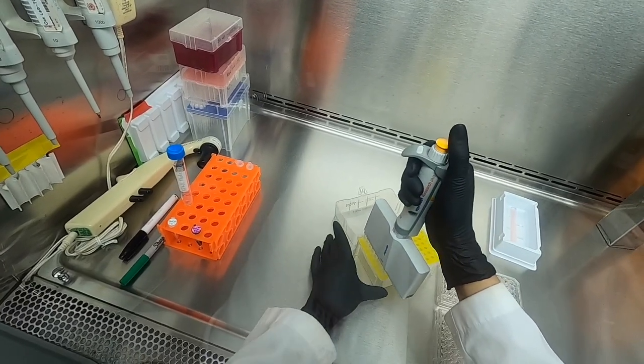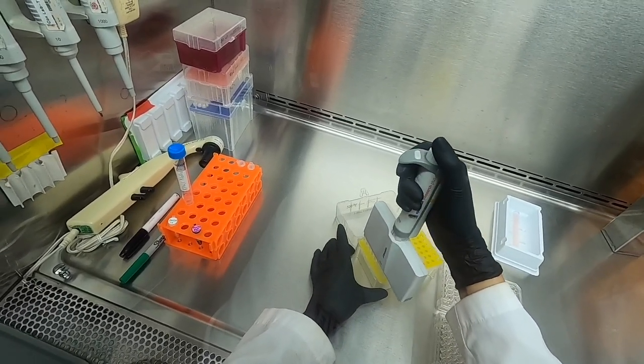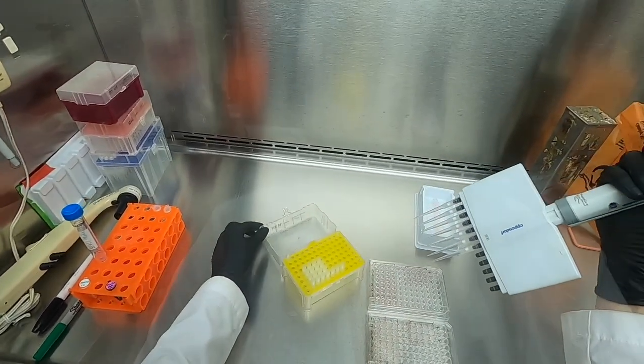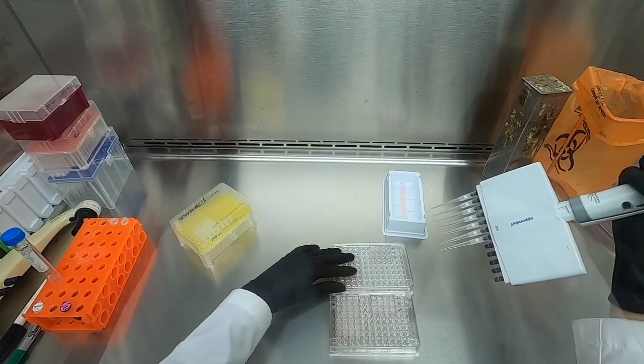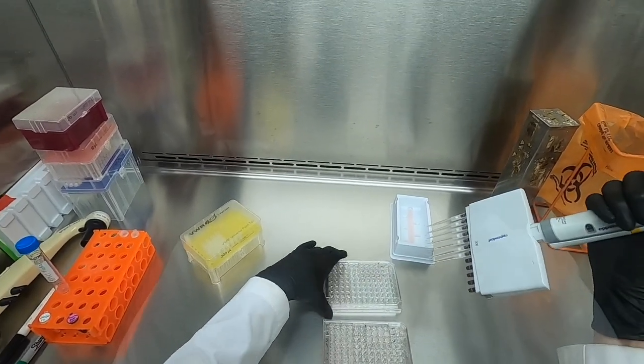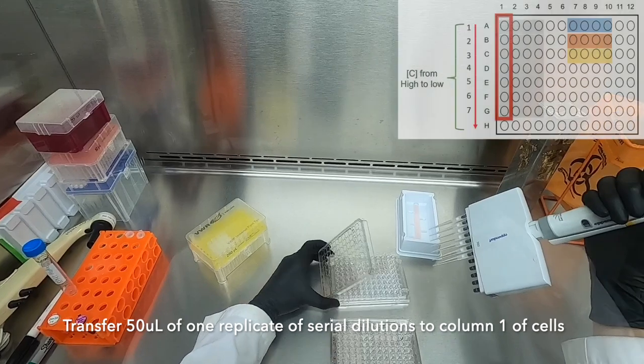In order to calculate the final concentration of compounds in our cell culture plate, it is important to note that each well has 100 microliters and we will be adding 50 microliters from our compound dilutions.